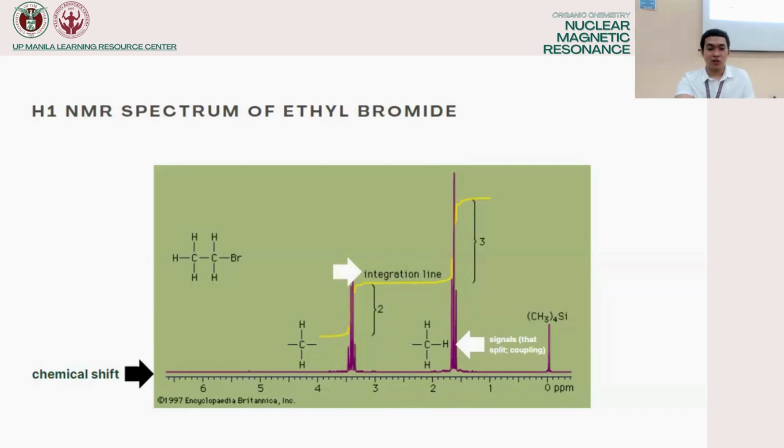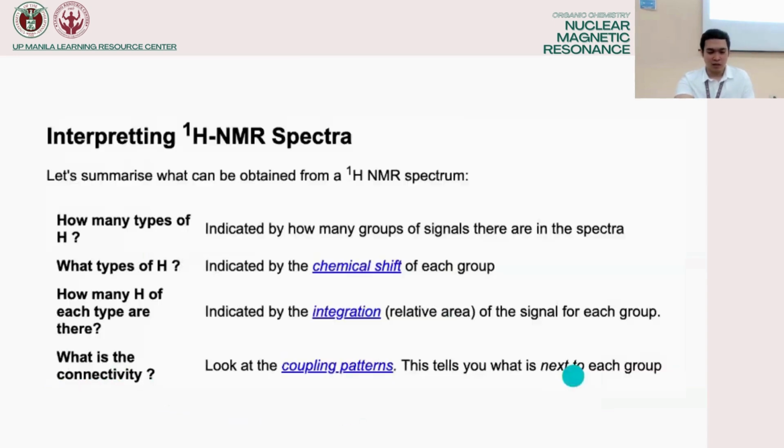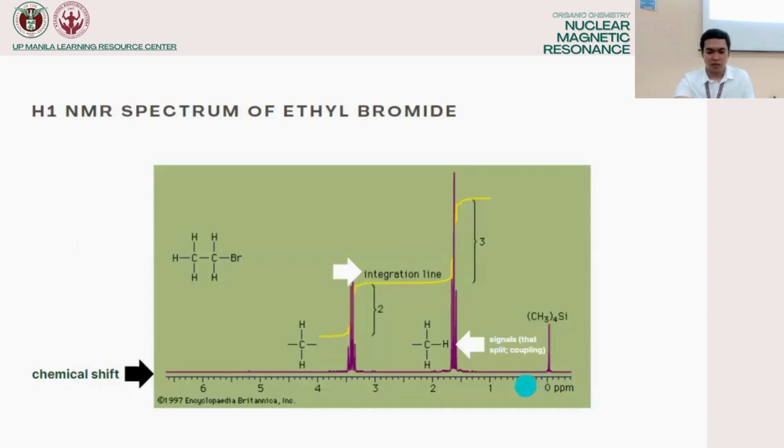Relative ratio. Number of hydrogen, carbon. H. Saan ang upfield dito? Is it 0 or 6? 0. Ang downfield ay 6. So, ayun, mabilis na, no? May nakakasagot, less than 10 seconds.